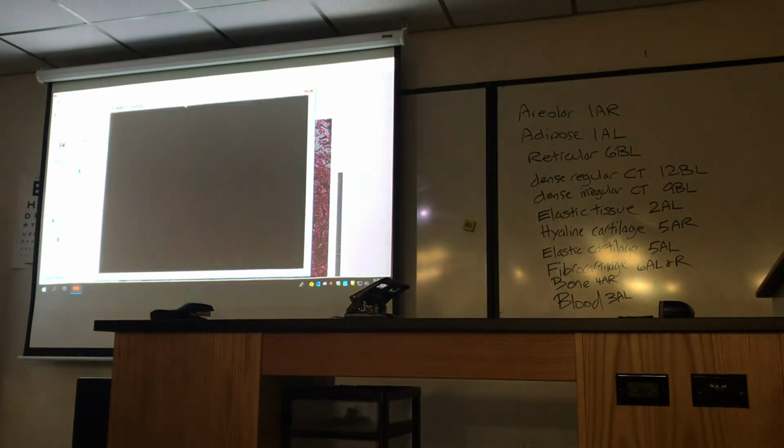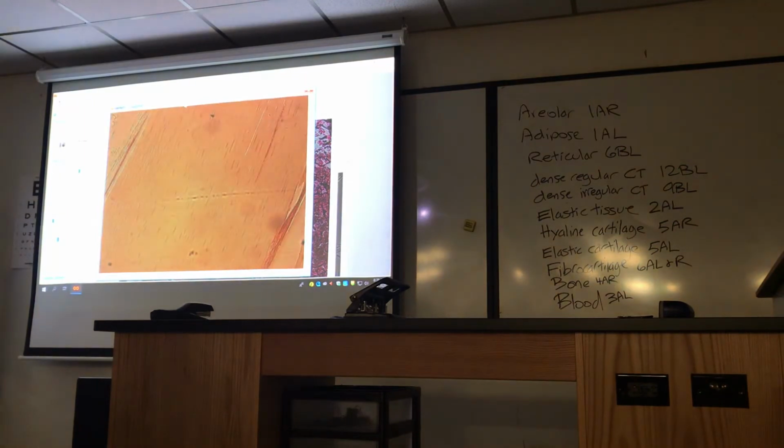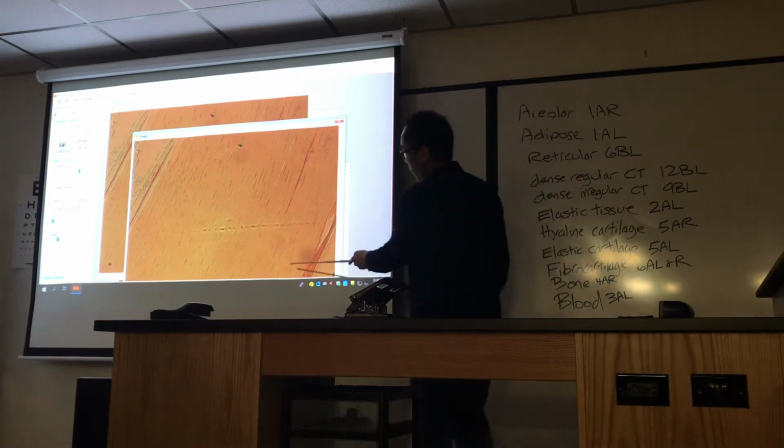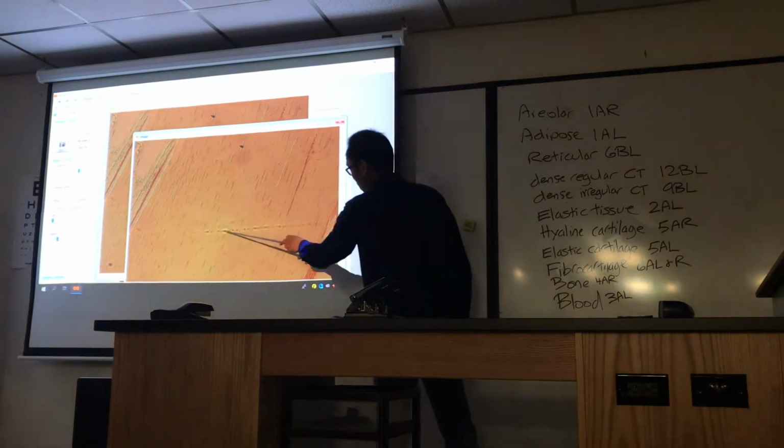Let's go to medium, see what that looks like. That's pretty good. I'll take a picture of it. The fibers are running this way. You see that? Don't pay attention to that. That's an artifact when they prepared the slide.